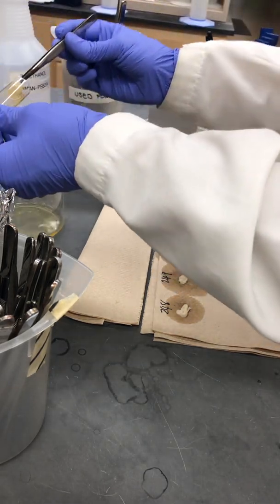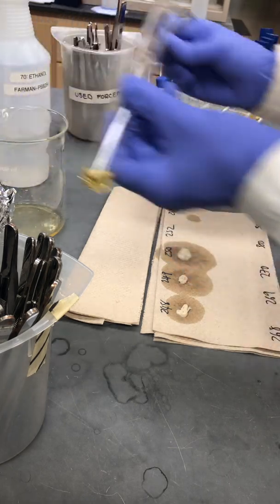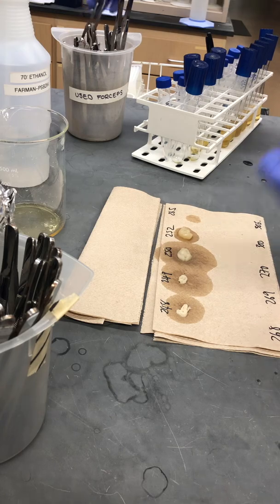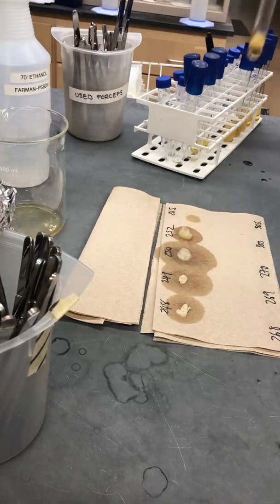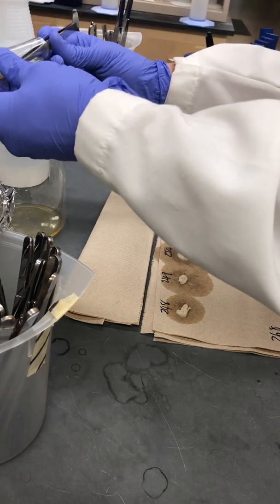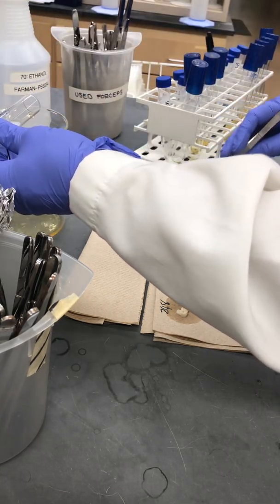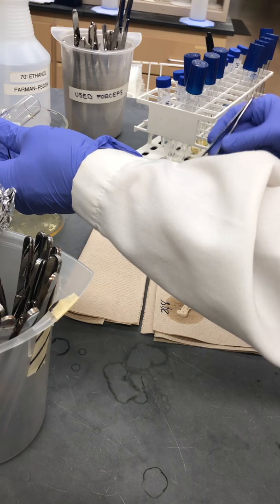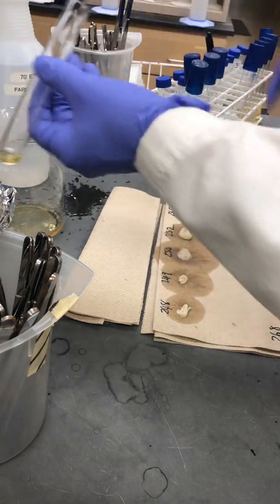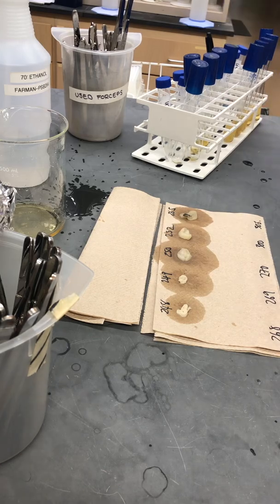Dump out the extra liquid into a container that will be autoclaved, blot the mycelial pellet, and then move on to the next one. We'll try and recover all the mycelium that's in the tube.